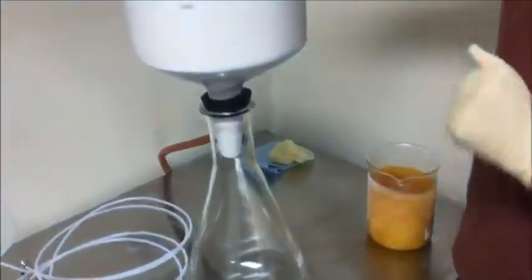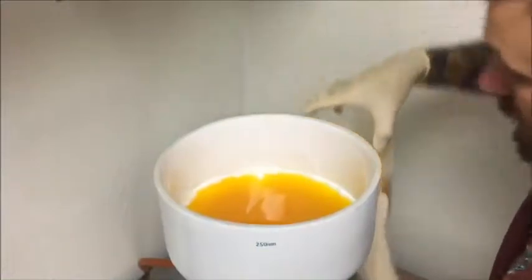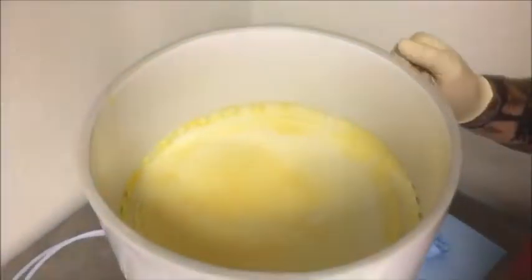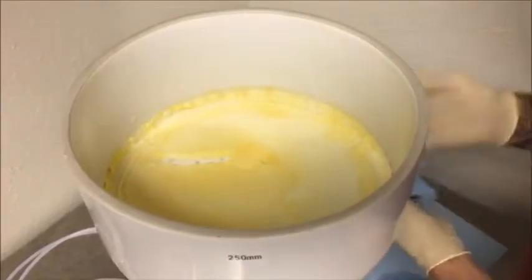We're going to pour it up here, then we're going to flip our vacuum pump on. And then going down through the bottom is our nice clean ethanol with the oil and no waxes. Right up here you can see all the waxes that did not make it through the filter paper. You see there, it's a bunch of plant wax. It's not quite done, we'll let it sit here another minute or so, and then we'll call it.